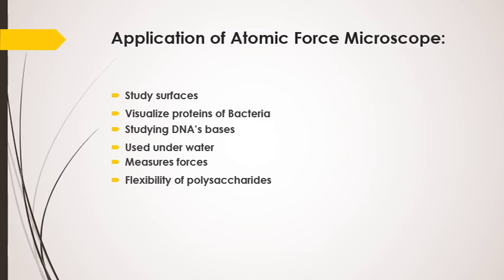It also enables us to produce images that can measure forces, for example, the force needed to unfold a protein located in the membrane. And the last one, it determines the flexibility of polysaccharide molecules.